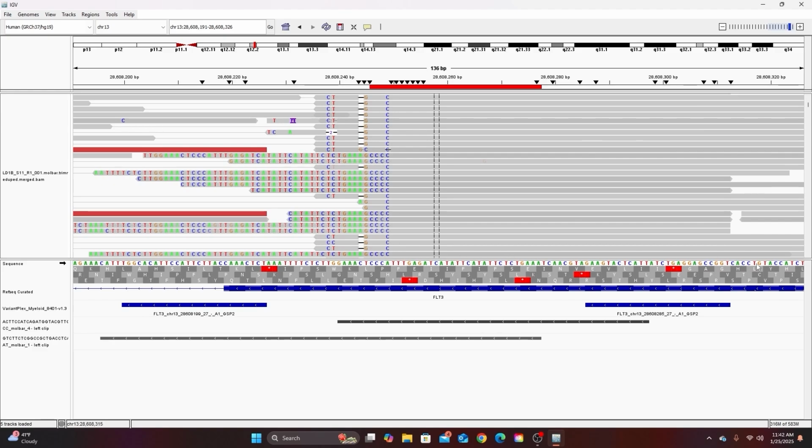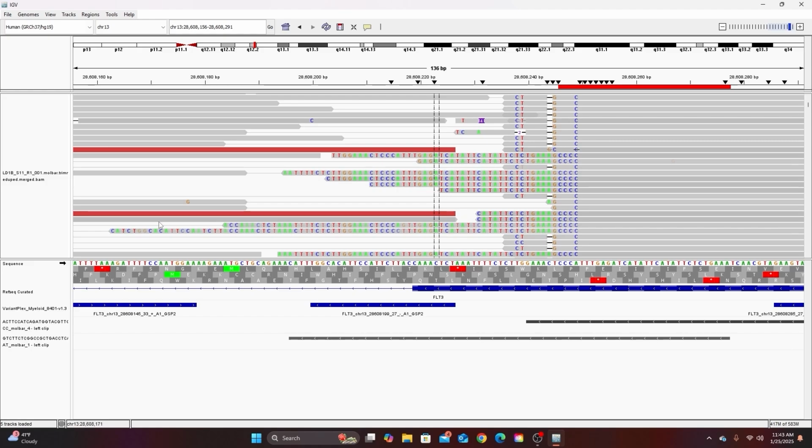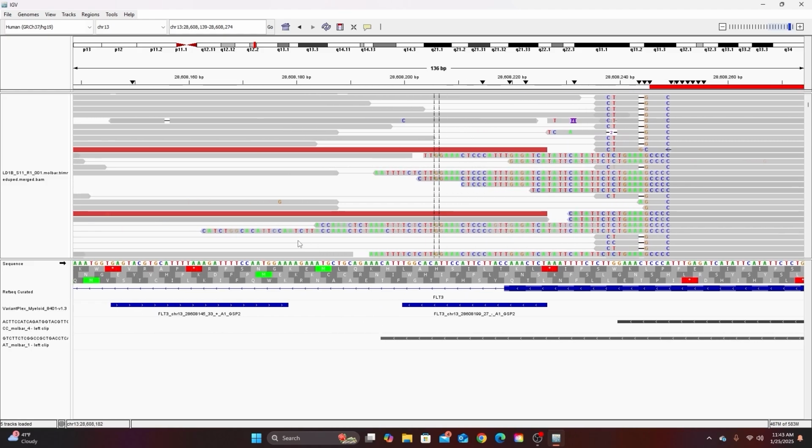So the patient's genome is normal, normal, normal, normal, normal, normal, up until about here. And then here, this triple A is repeated and then just keeps going and going. So these breakpoints indicate the segment that's copied and duplicated again over here. But even though this segment that's copied is small, it ruins the alignment for a much longer region, right? Because everything after that is shifted over into the wrong place relative to the reference genome.